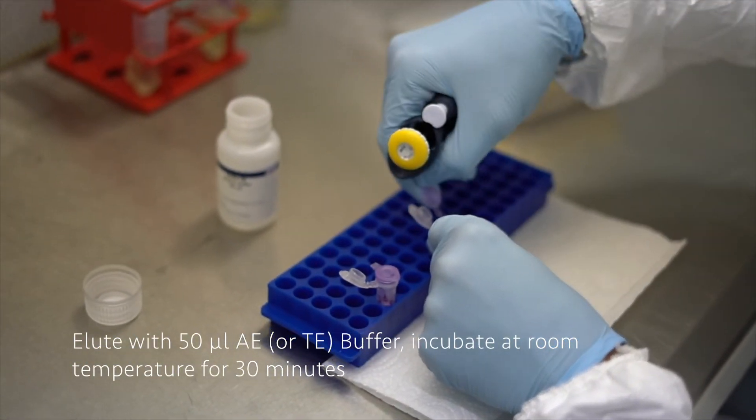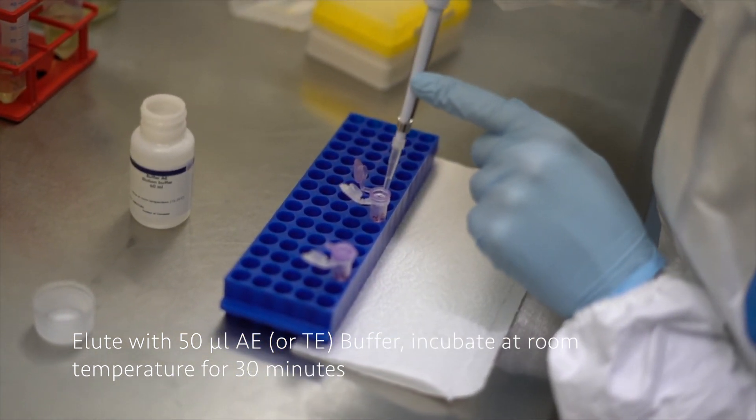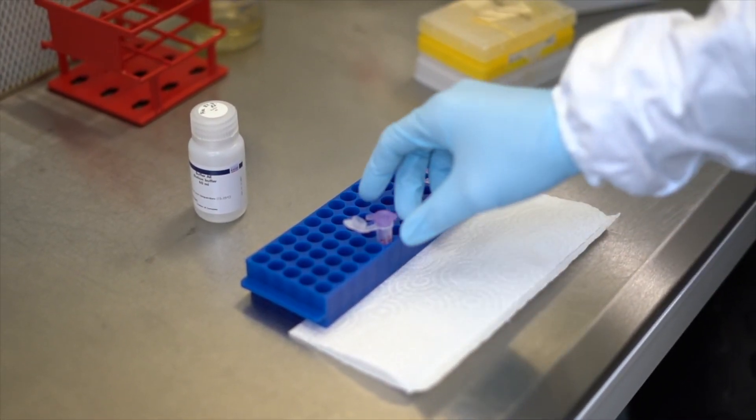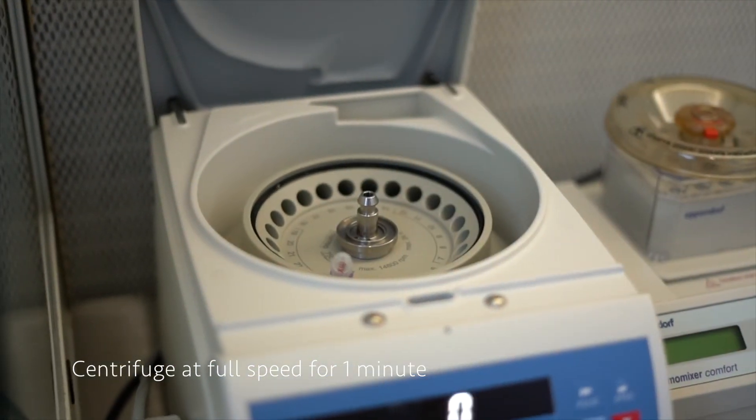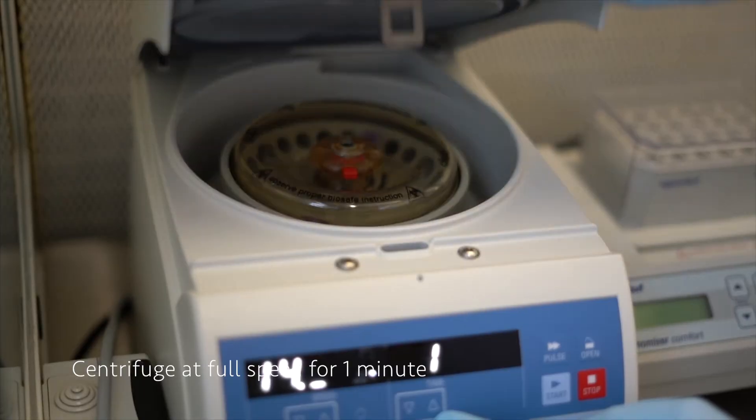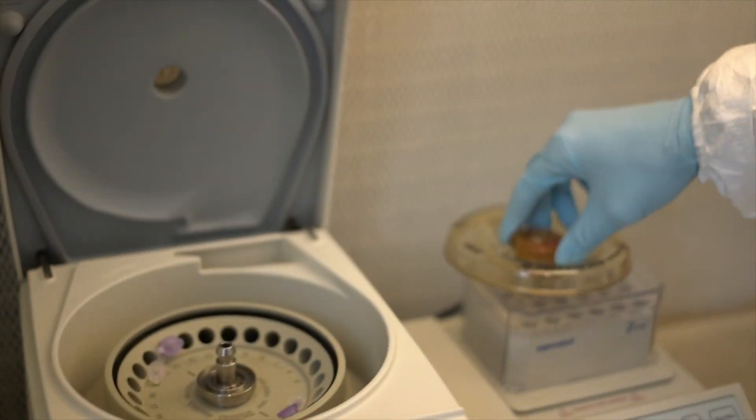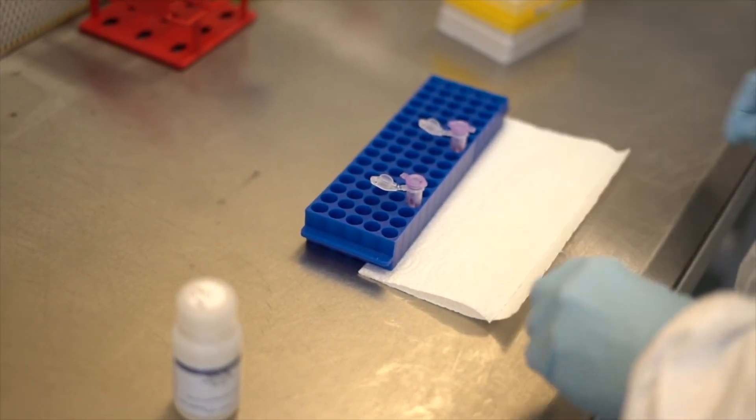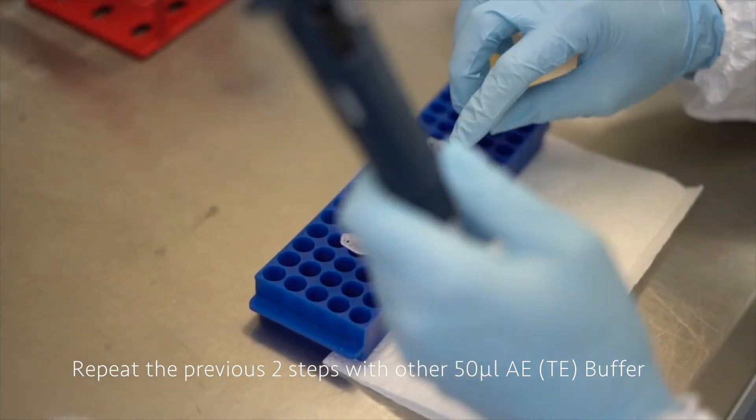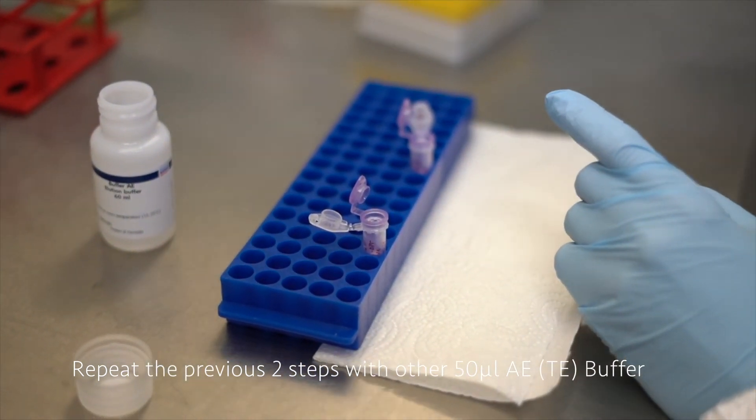Good, 30 minutes are over. Now we have to put the samples back to the centrifuge and centrifuge them for one minute at full speed. We will repeat the elution step again with 50 microliters of AE buffer, again incubating it for half an hour at room temperature.